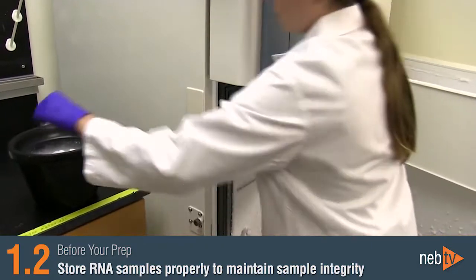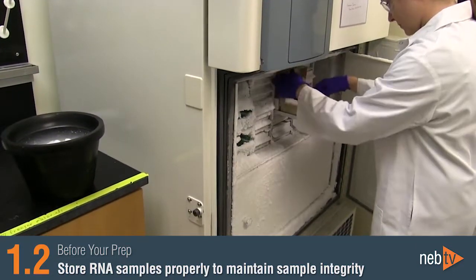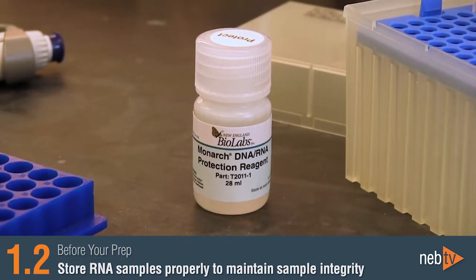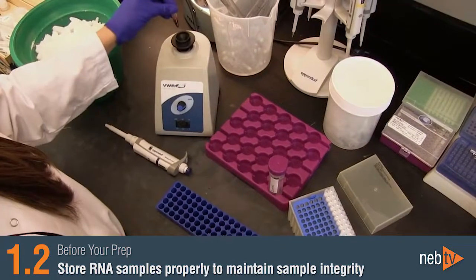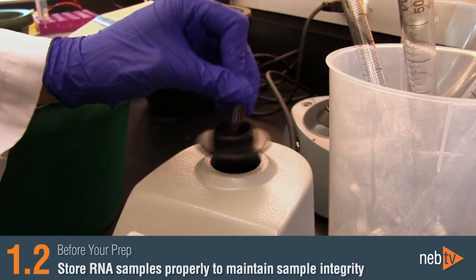To maintain RNA integrity of your sample prior to the prep, samples should be frozen at the time of harvest or protected by a dedicated reagent such as the Monarch DNA and RNA protection reagent, which is included in our kit. Cultured cell pellets or aliquots of blood preserved with this protection reagent should be mixed thoroughly by vortexing or pipetting prior to storage.